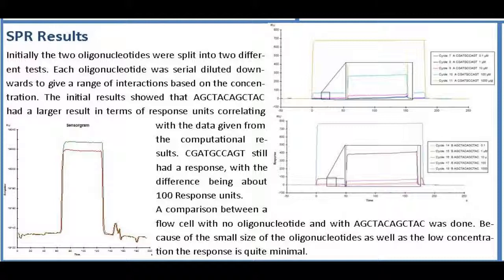As such, the fluorophore and quencher investigation was used to confirm an interaction. The low response could be due to the small size of the oligonucleotide, only being about 10 base pairs long, or due to the CM5 chip taking a less than desirable amount of glucose onto the dextran strands. A further possibility could be due to the fact that the interaction between glucose and the DNA aptamer is of a hydrogen bond nature, as the computational data lends this suggestion, as well as the SPR results.